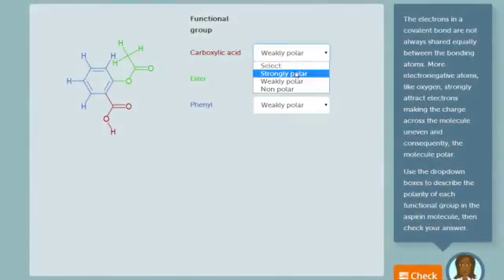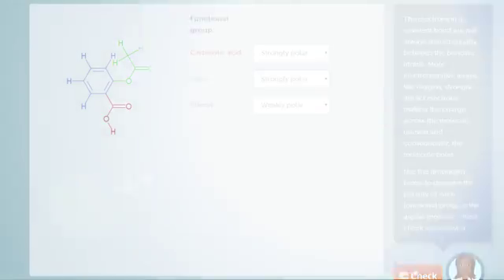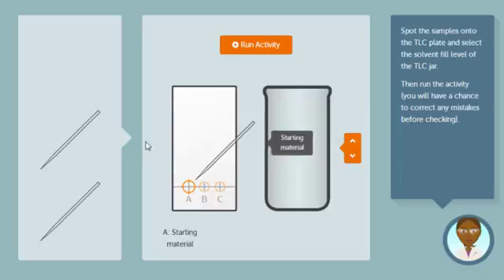In this activity, you'll learn about the chemical properties of aspirin, you'll get to purify your sample by recrystallization and then analyze it using thin layer chromatography.